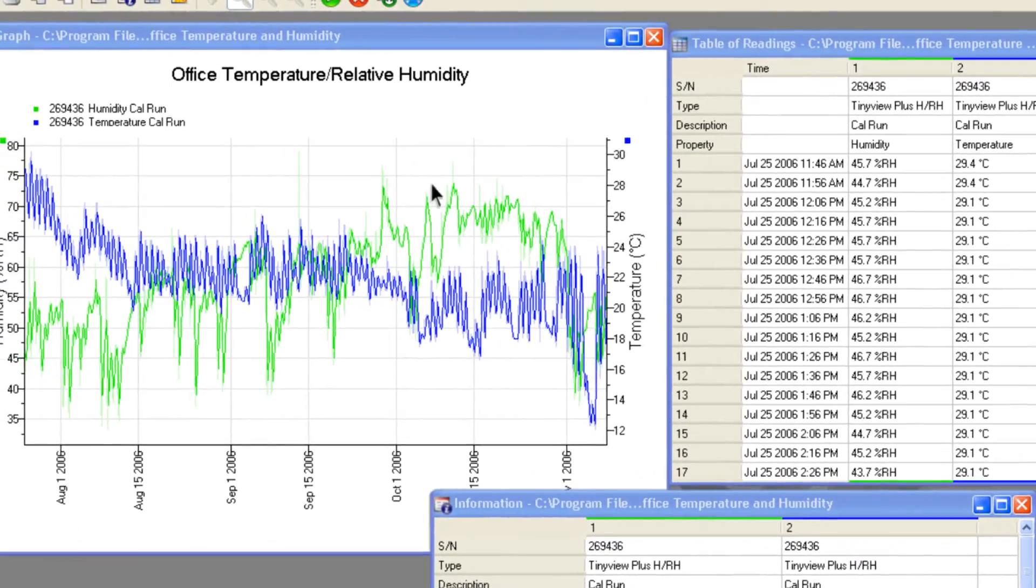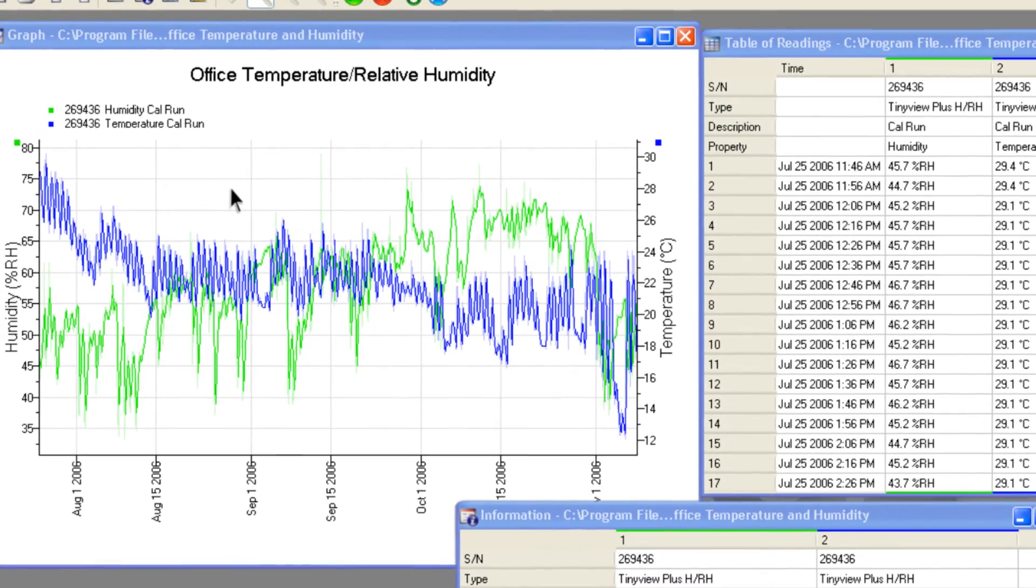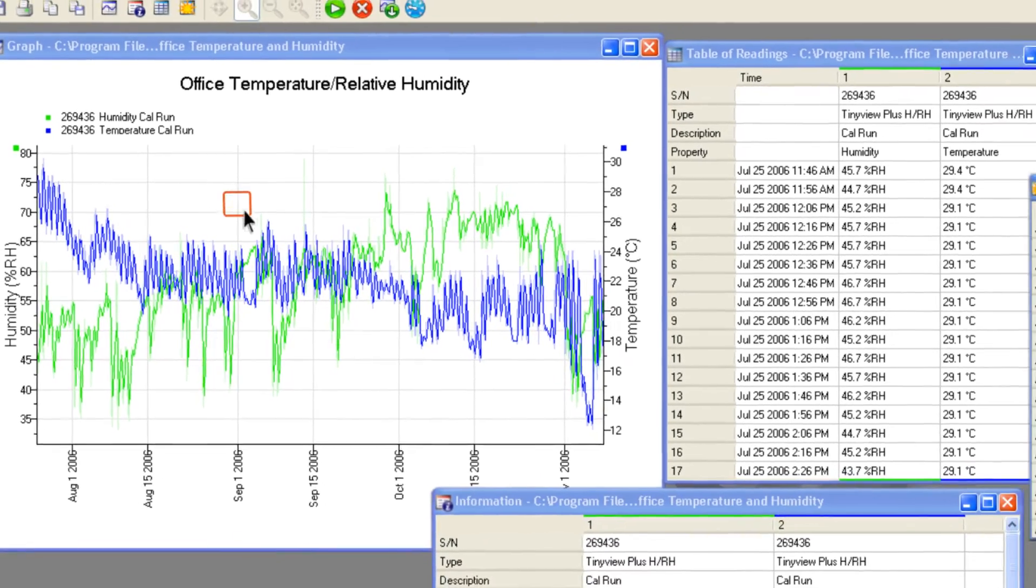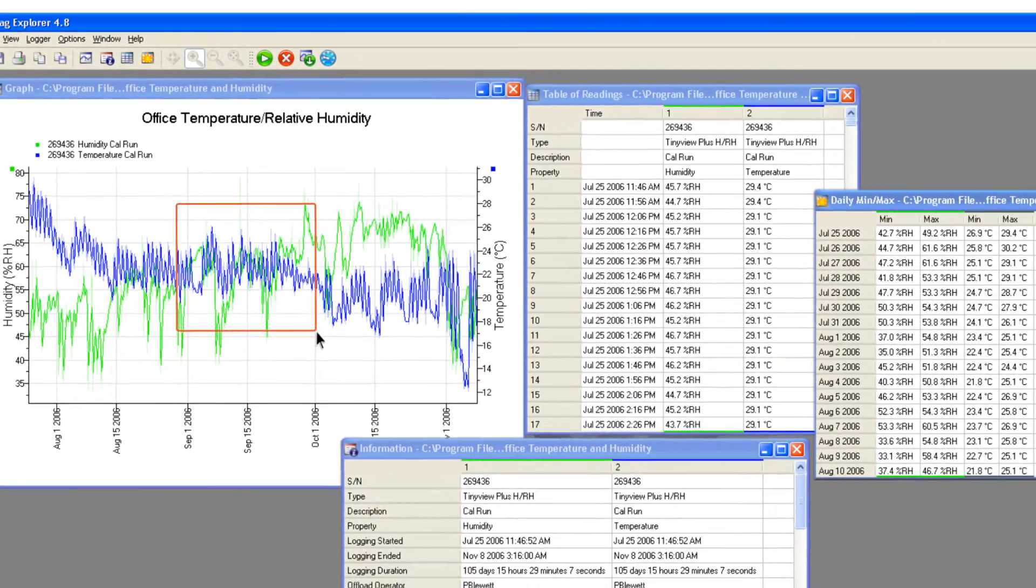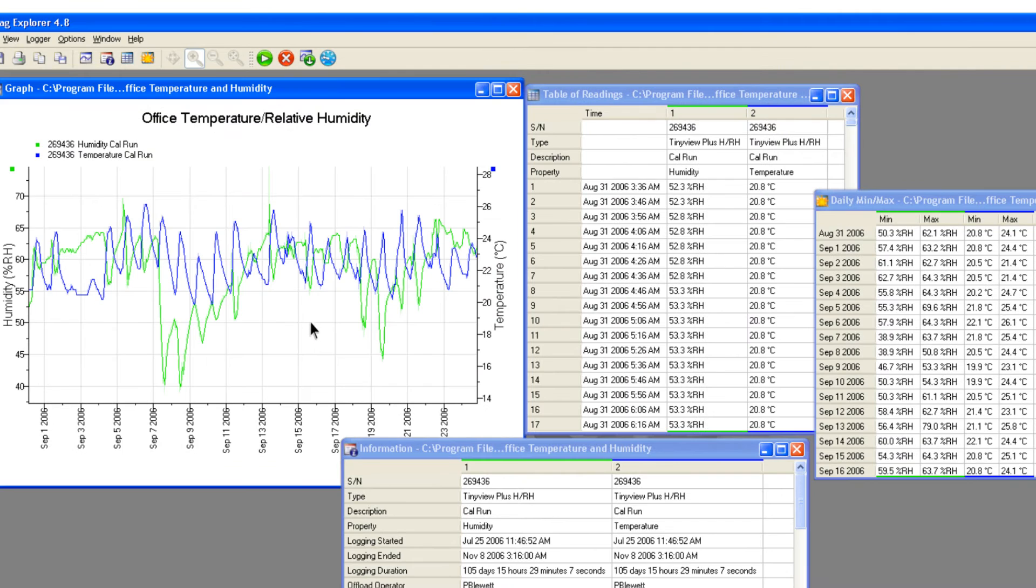These views are all linked and a set of zoom options that allow more detailed viewing of interesting data on a graph will automatically update the other views as the zoom range is changed.